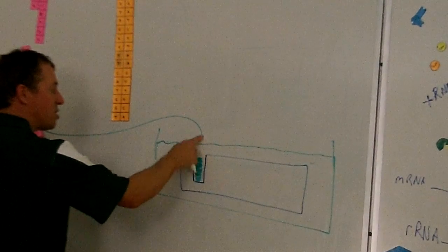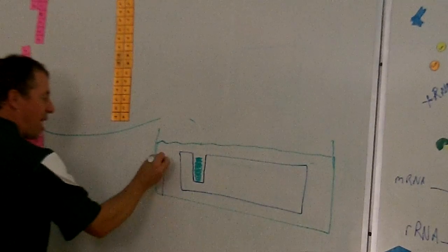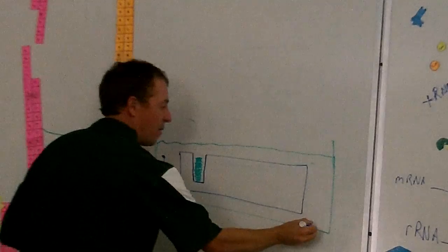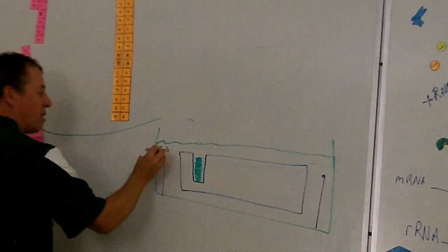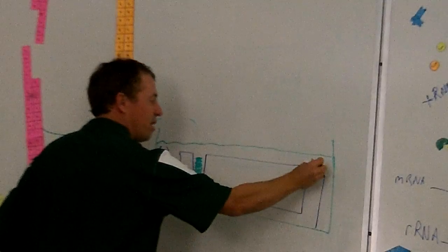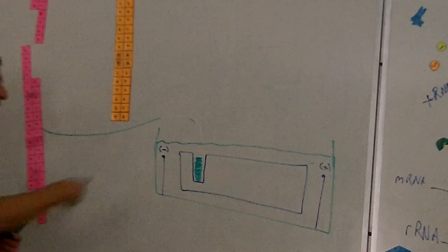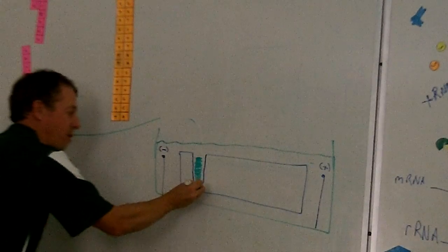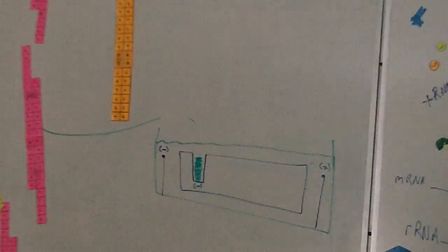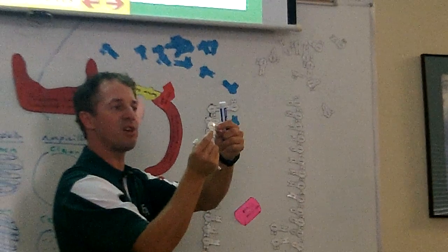What you do is you put an electric wire on each side. And this wire over here has a negative charge. And this wire over here has a positive charge. And the DNA is negatively charged, you see. Because these little phosphate groups on the nucleotides, those are negatively charged.